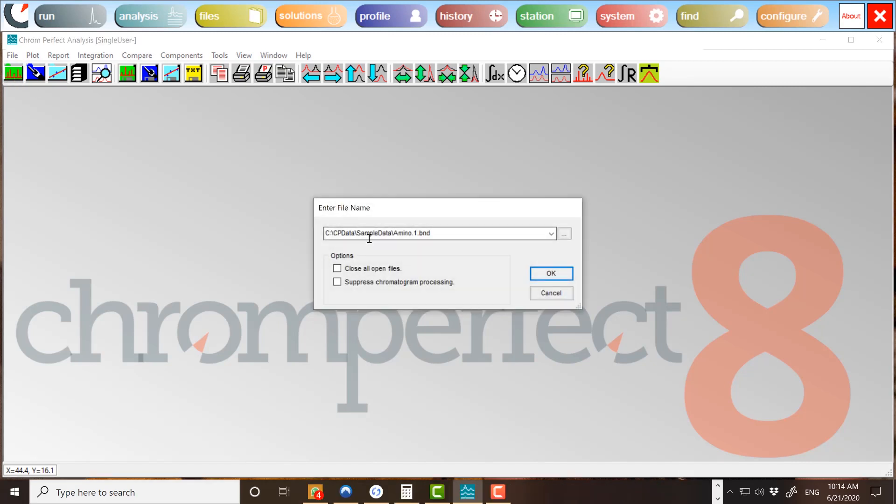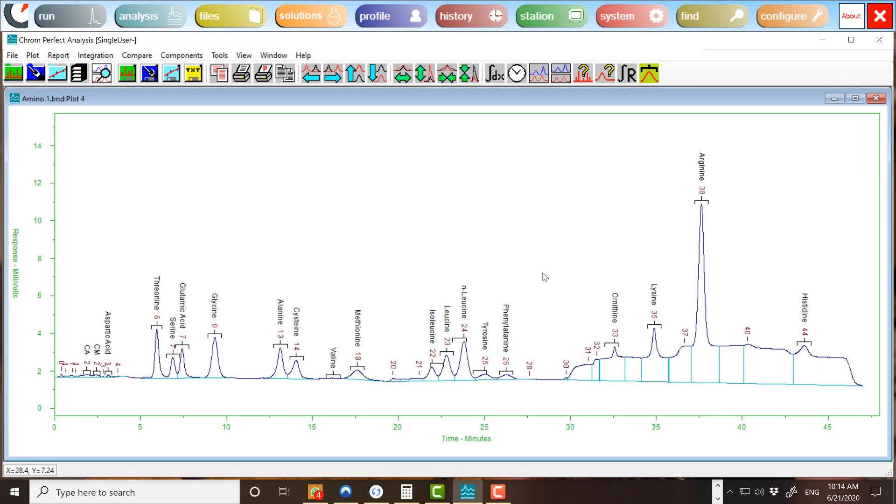Whenever a data file is opened, the analysis program integrates the chromatogram according to the threshold and peak width settings and the timed events in the method file. If the integration is not satisfactory, these settings may be changed and the plot will change to reflect the new settings. Most chromatograms will give a satisfactory integration when the threshold and peak width settings are correctly set.